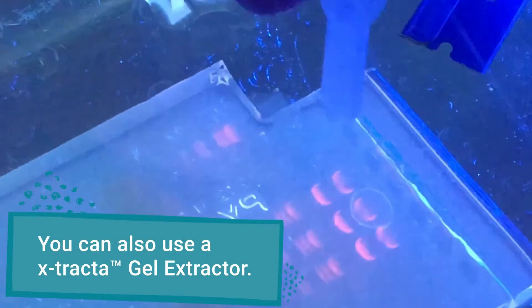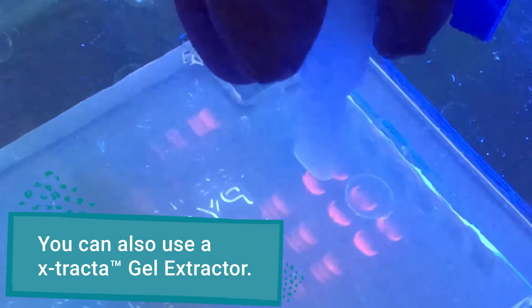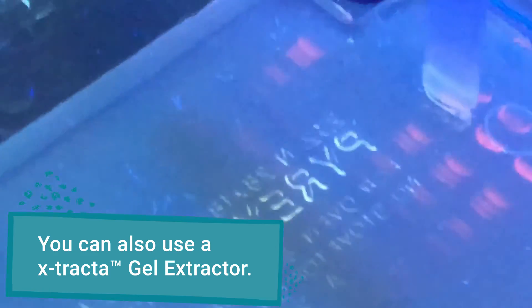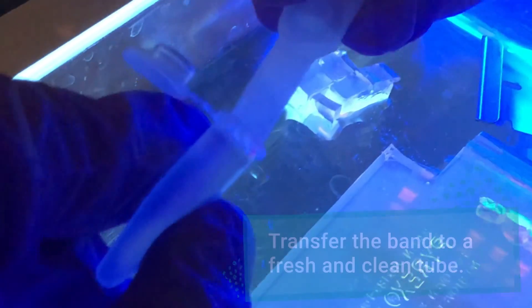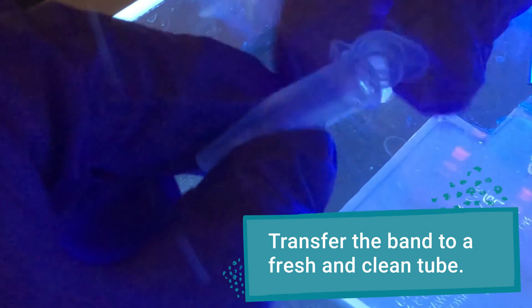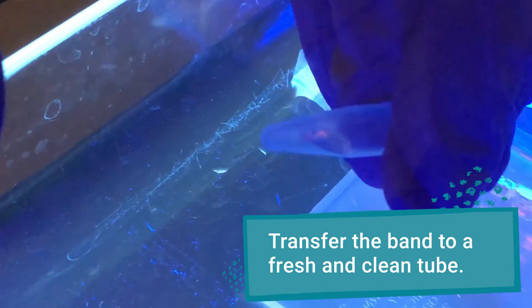You can also use a device such as the x-tracta Gel Extractor. To use this, carefully insert the device into the gel, rock slightly to make sure you've cut all the way through, and then pull it out of the gel. You can then squeeze the piece into a fresh tube.